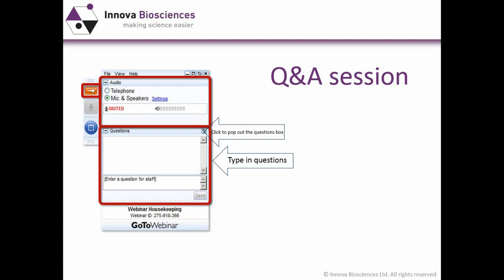Another question here. What is the best Raman dye? We haven't done a huge amount of work on Raman, so I'm probably not the best person to answer this question. However, rhodamine 6G seems to be quite popular. Our next question: is a disulfide as good as a dithiol for the self-assembly approach? Generally speaking, thiols give tighter binding than disulfides, so if you want a stable attachment, probably the dithiol is better.